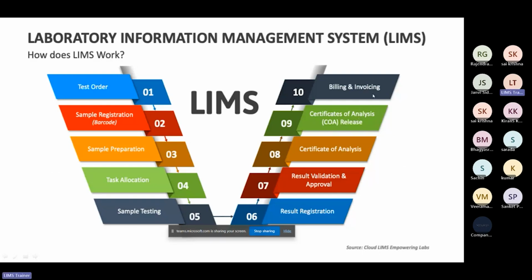And then comes billing and invoicing. All these activities can be handled by LIMS itself. Is this clear?